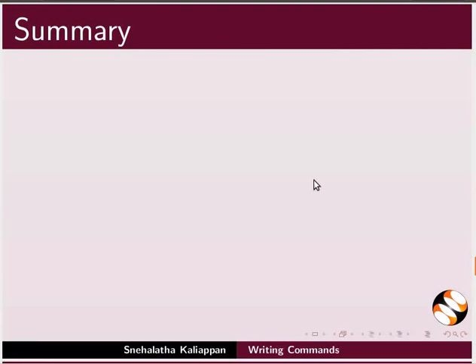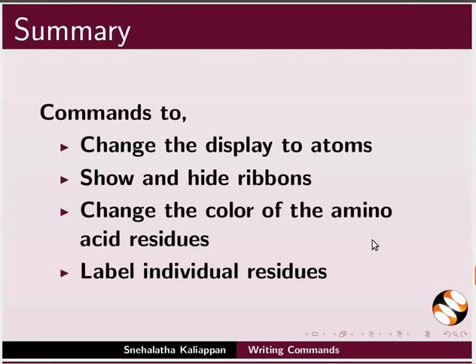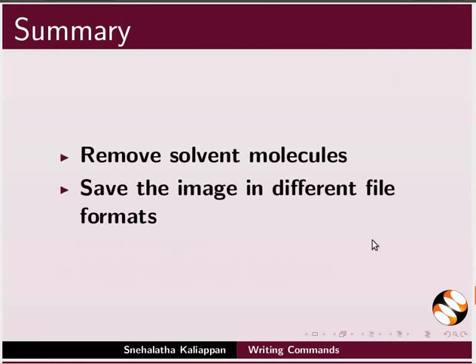Let's summarize what we have learnt. In this tutorial, we typed commands to change the display to atoms, show and hide ribbons, change the color of the amino acid residues, label individual residues, remove solvent molecules, and save the image in different file formats.